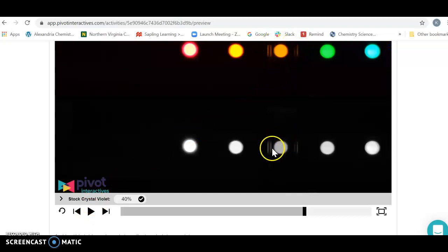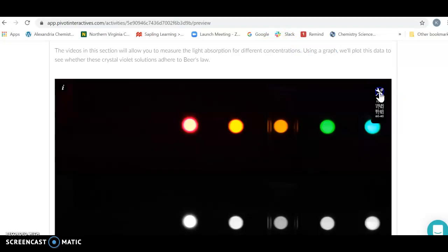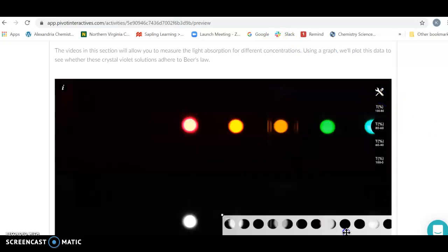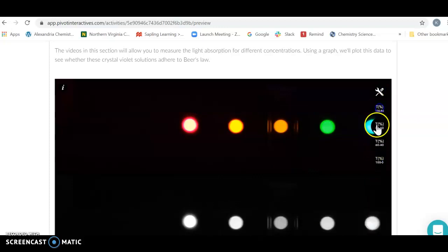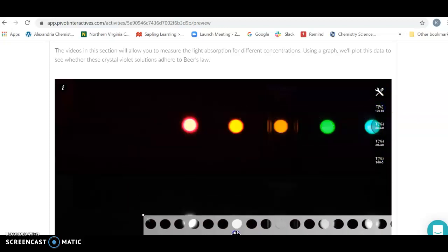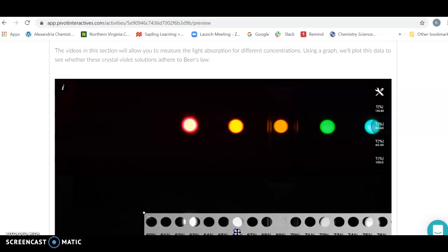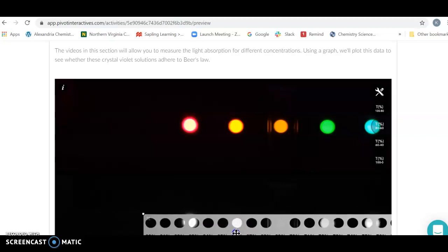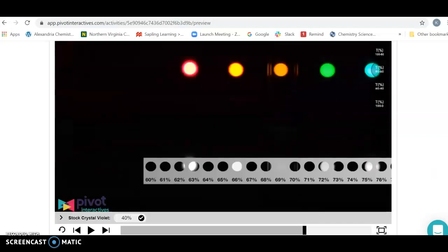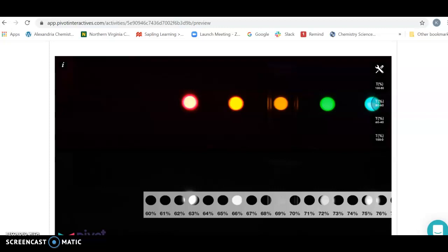I saw it go over that yellow — I've got a nice color change. I'm going to go to the tools and estimate that it's in here somewhere. You grab the right grayscale and shift it until you get the color of the grayscale to fit in and just disappear into that ruler. Once you've done that, remember that is going to give you the percent transmittance.